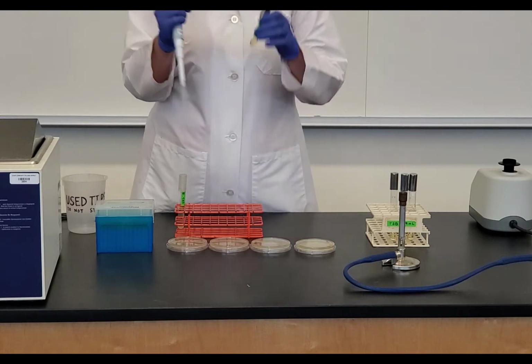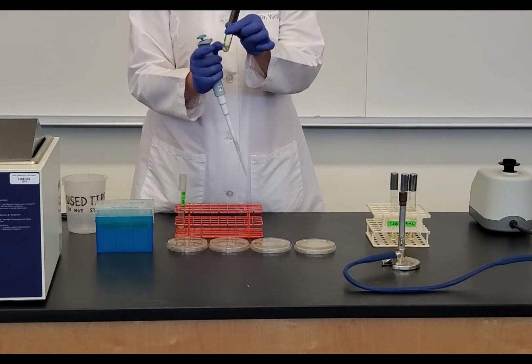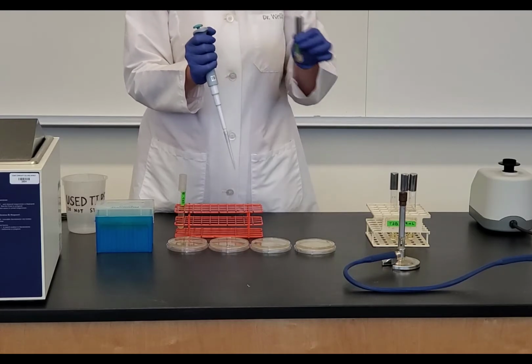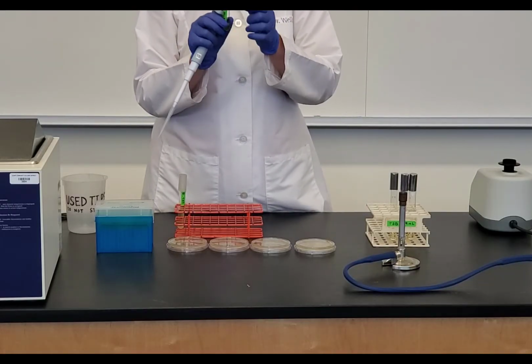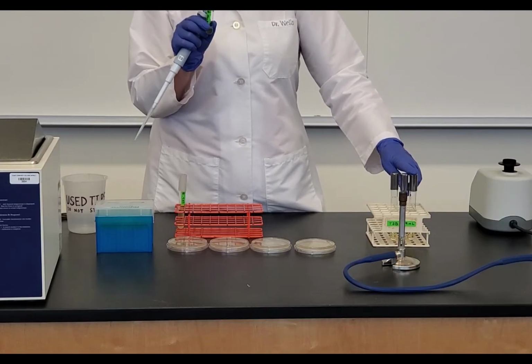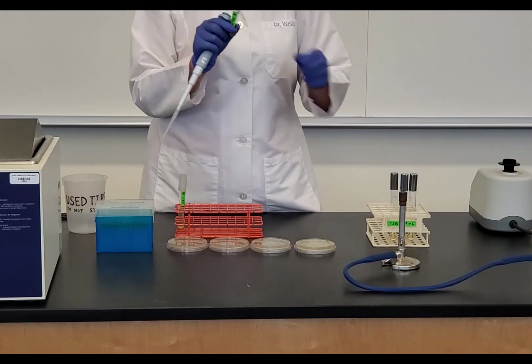I am going to take my phage, this is the one that I'm going to do my serial dilution, and I'm going to vortex to mix. I can either do this manually, or I can do this using an electronic vortex. Either would work. And so I need to start by transferring 100 microliters of my phage stock into my 10 to the negative 2. This dilution in this tube is going to be 10 to the negative 2.